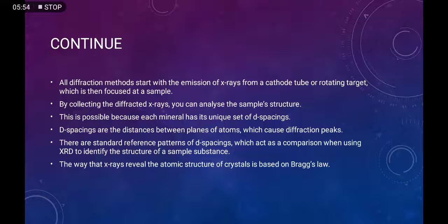Crystal atoms scatter incident X-rays primarily through interaction with an atom's electrons. A regular array of scatterers produces a regular array of spherical waves. In the majority of directions, these waves cancel each other out through destructive interference, but they add constructively in a few specific directions.